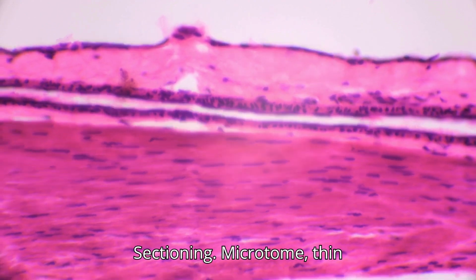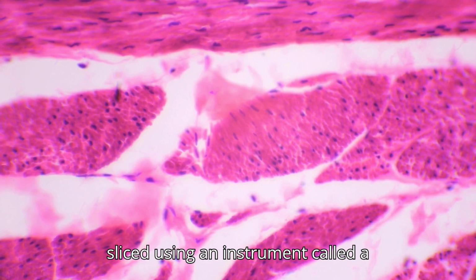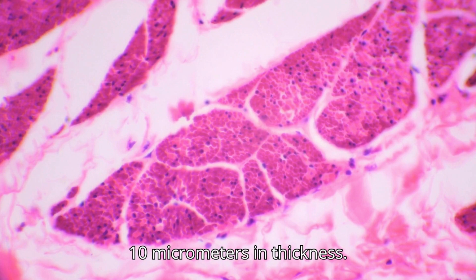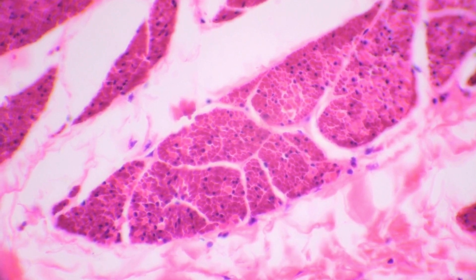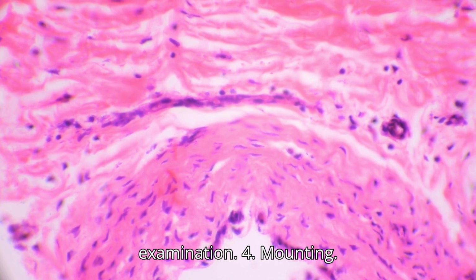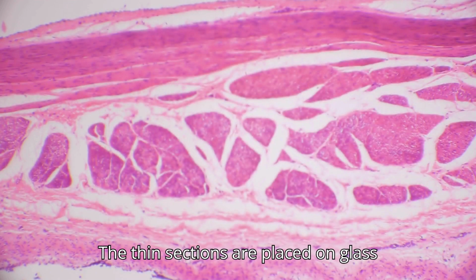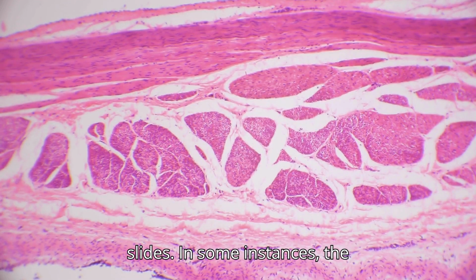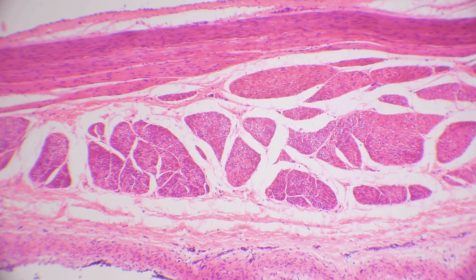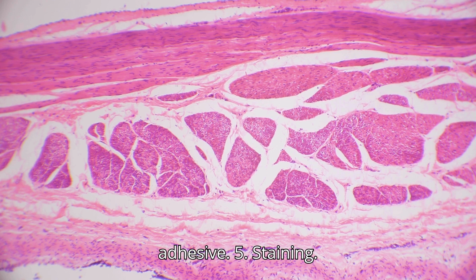3. Sectioning. Microtome: thin sections of the embedded tissue are sliced using an instrument called a microtome. It is usually 4 to 10 micrometers in thickness. Thickness: the thin slices allow light to pass through the microscope for examination. 4. Mounting. The thin sections are placed on glass slides. In some instances, the paraffin may be melted out, if necessary, and the sections are allowed to stick to the slides, often with the use of an adhesive.